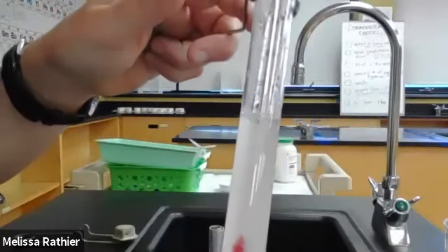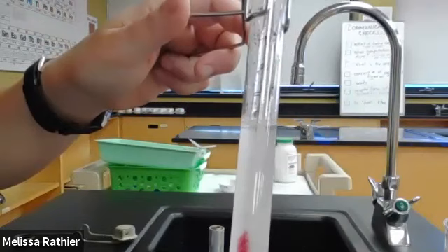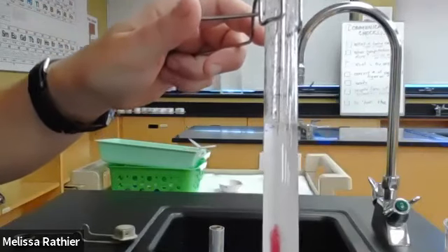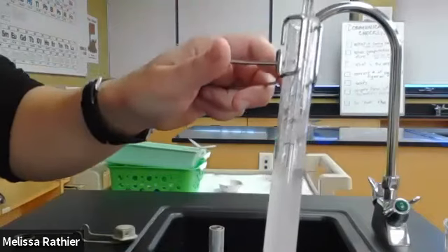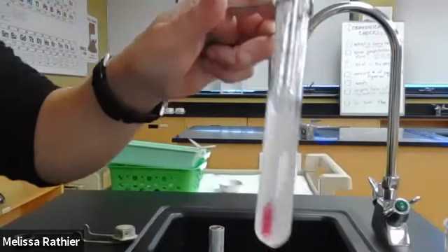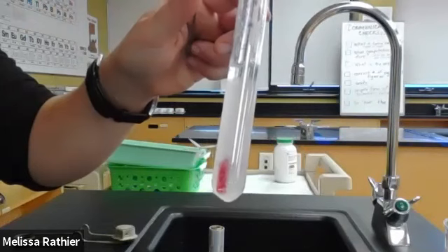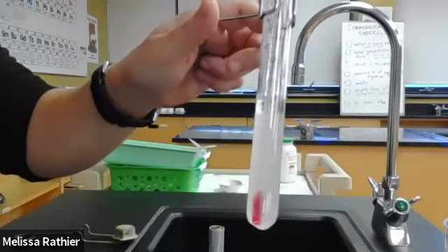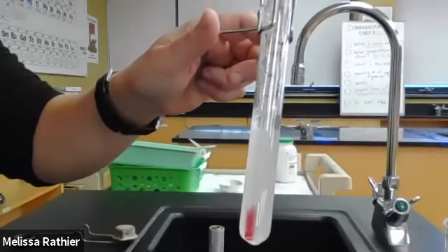And the type of solution that I have here was supersaturated, because I'm able to crystallize. So when you have a supersaturated solution and you add one more crystal, it will cause crystallization.